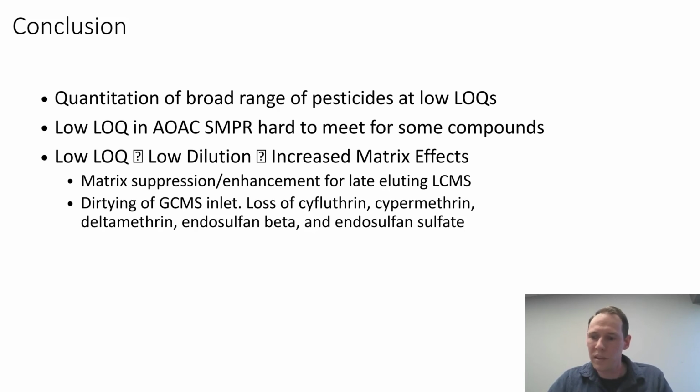And overall, again, I think it's important for the industry moving forward to consider the fact that cannabis is a complex matrix. And as I've seen in this method development, what works for one type of strain might not work for another, especially when it comes to pesticide testing, and any potential future developments of a standardized method for pesticides in cannabis should keep this in consideration.